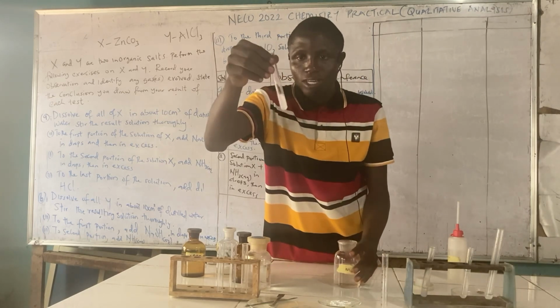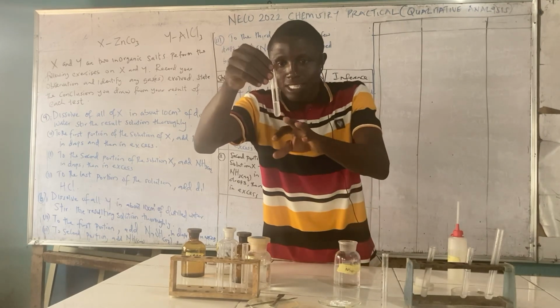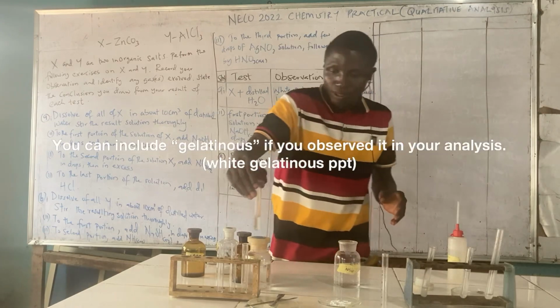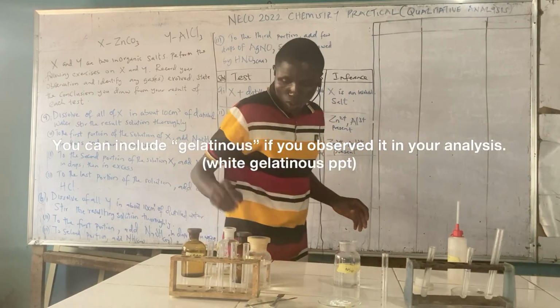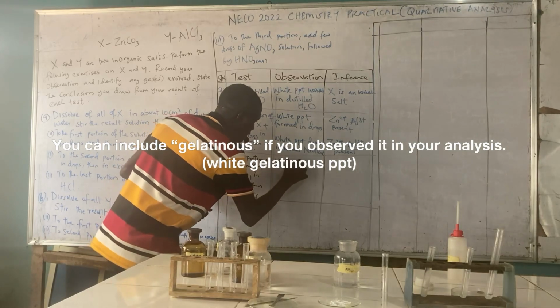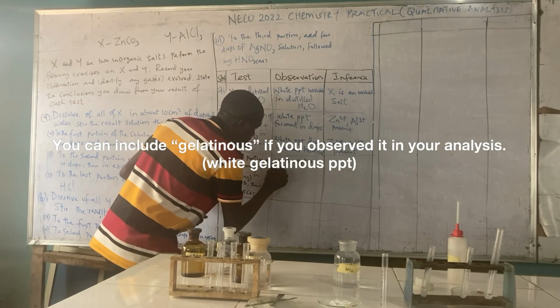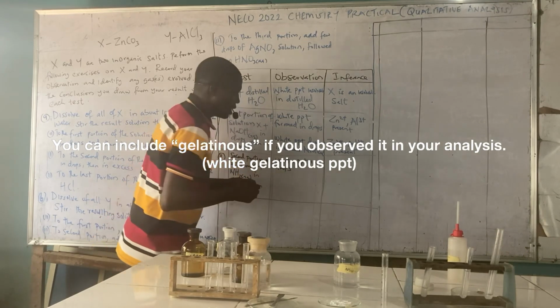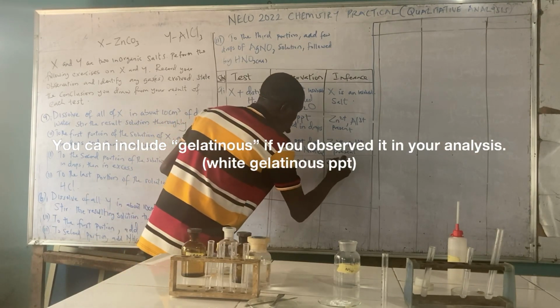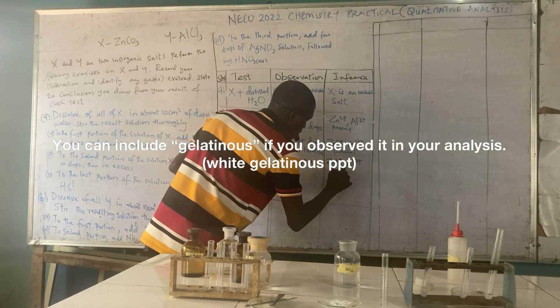You can still see white precipitate. You can see it's becoming light, almost like white precipitate in drops. So white precipitate in drops, white PPT as well in drops. Then you see suspect zinc 2+ and aluminium 3+ present or suspected.